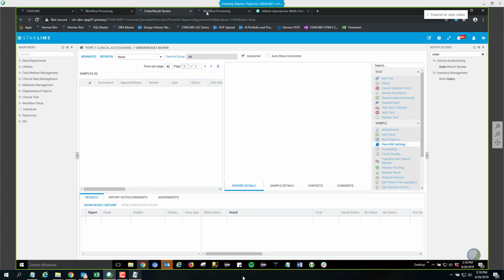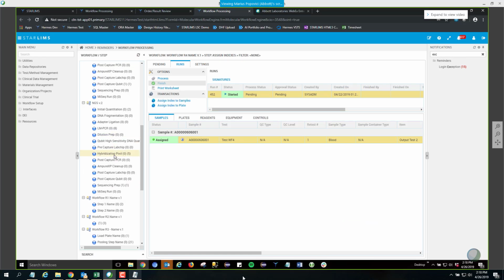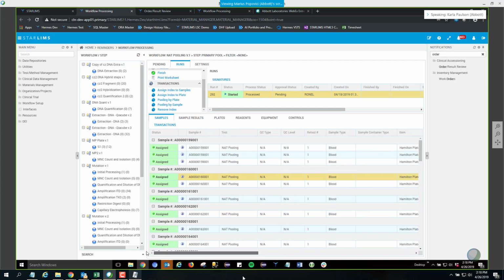Marius, would it be possible to have frozen columns in that grid when you scroll, because there are so many columns that you have to scroll to the right, so we don't lose track of the sample number. Frozen columns. Yes, please, because I think that would be good. I don't know up to which column, how many columns. I would think at least the first 4, up to the QC level. Yeah, that should be fine. Because then at least we know what sample we're looking for when you scroll all the way to the right. Yeah, thank you.